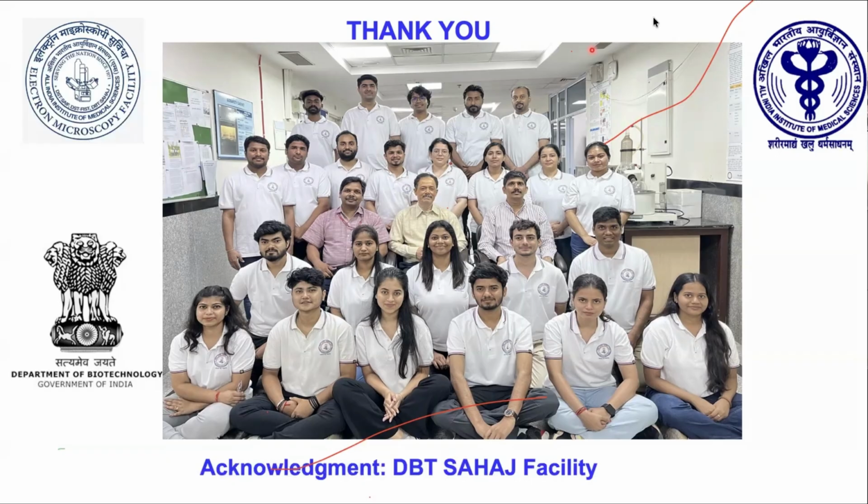But I don't understand the question clearly. What is the biological question you are going to answer by using this, sir? It's already known. Simple immunofluorescence with confocal can tell you that the virus is there inside. Why go to these high-end techniques? I think she has a follow-up question. Any precursor assays that would be better? For what? To identify early detection.